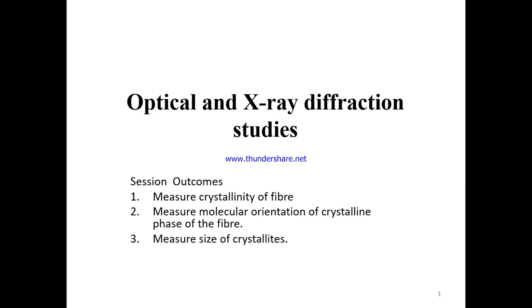So last class we discussed the density of textile fibers and the measurement of density of textile fibers by density gradient column. So we should proceed further. Our next topic of discussion is optical and X-ray diffraction studies.